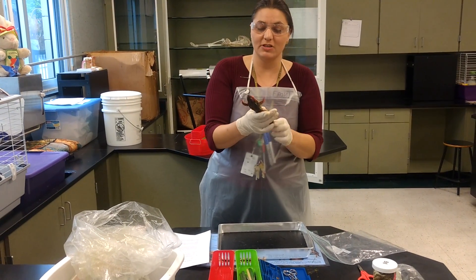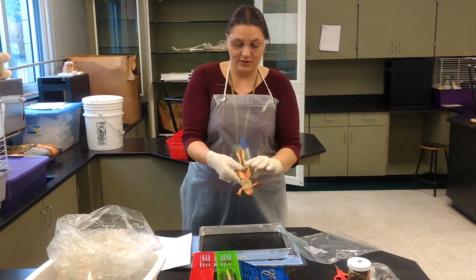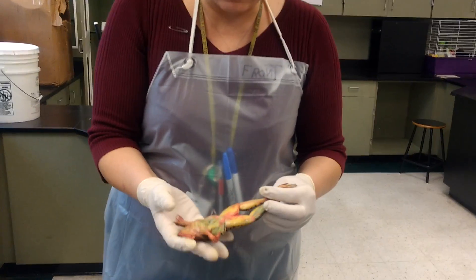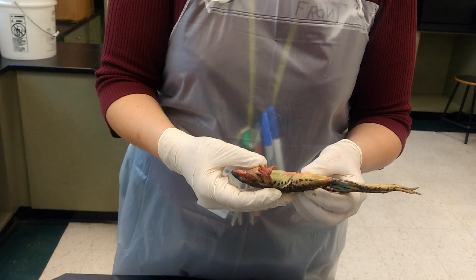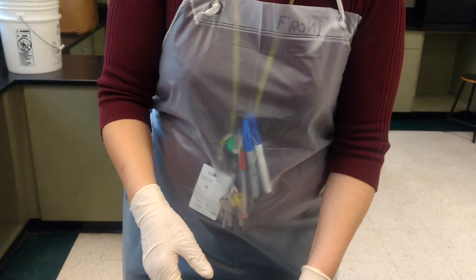Do not bash it or squeeze it — frogs are frogs. Matthew, can you come closer please? This is a frog that has had latex injected into it. The red is where there was artery and blue is where there was vein. Go ahead and put your frog down.